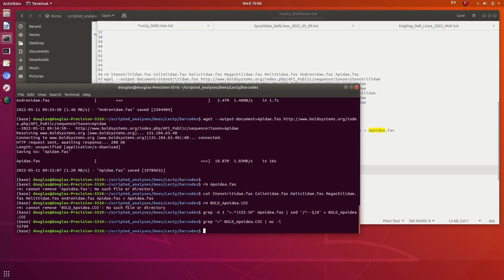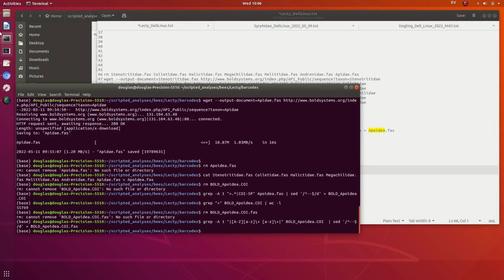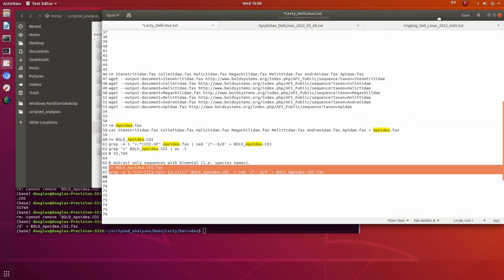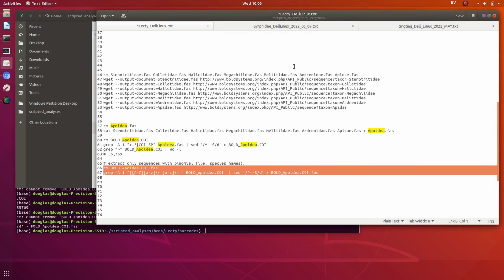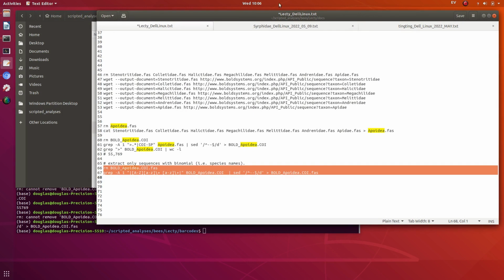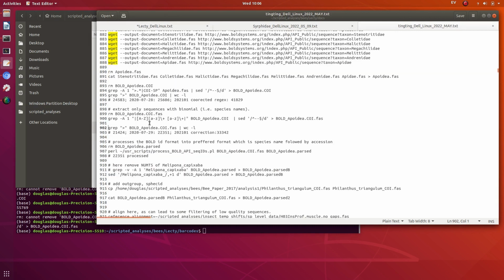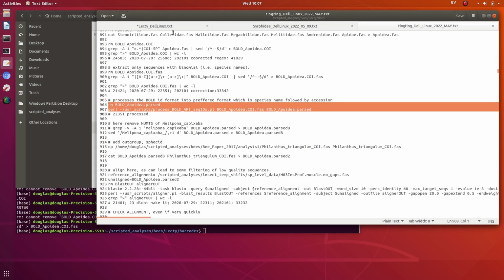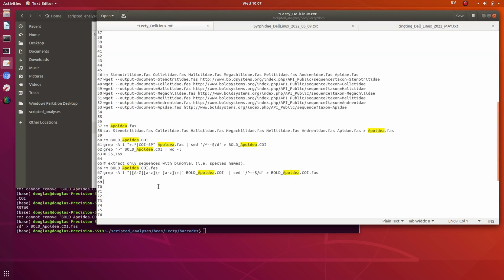Put that into a new file. Yep, so about a quarter of these will have been not fully taxonomically assigned, or assigned with some unconventional label, which is a bit awkward to work with. So I'll just get the easy stuff out. Perl script to simplify the FASTA ID lines.